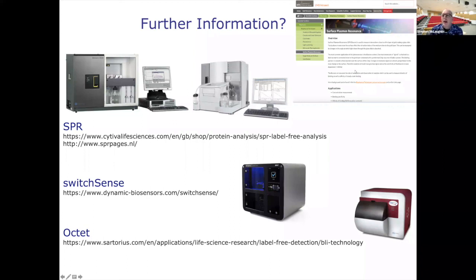Okay, George wants to study a DNA binding interaction. What's the size range of DNA that can be used? Well, there are two types of DNA nanolevers, a 48 and a 96. But you could also extend that DNA region by having a single strand that goes beyond the nanolever and forms a duplex with your strand. You could have a specific sequence beyond the nanolever, but you will reach a point where the switching probably won't be as good, or you get some more flexibility in there. The question would be how long you need it to be to look at the interaction. But we have done lots of experiments where we have had DNA on the top and looked at interaction.